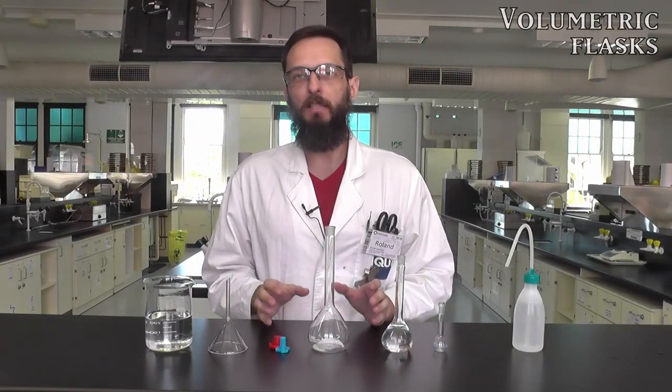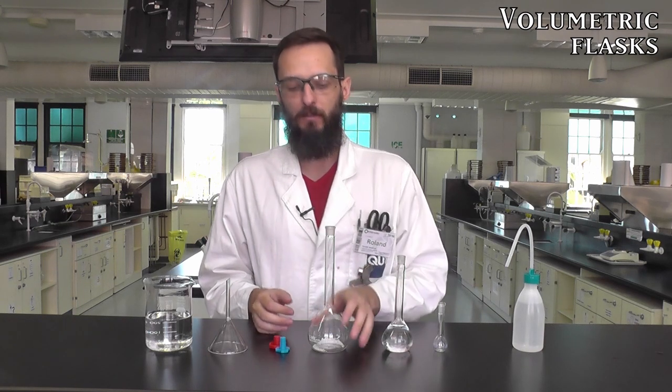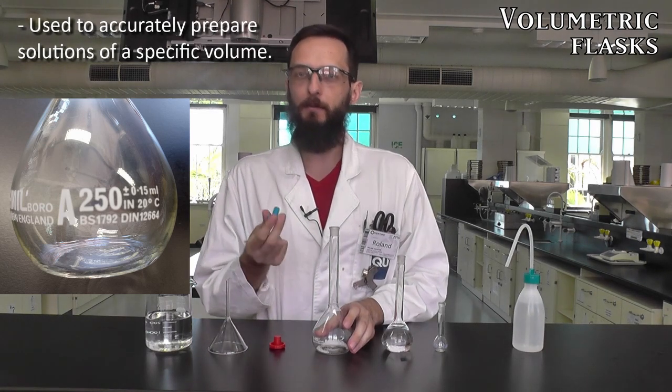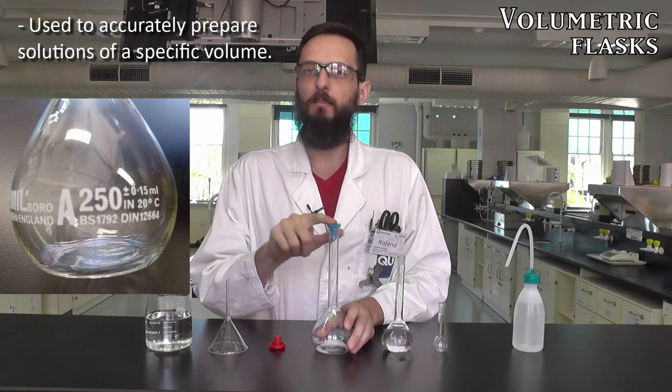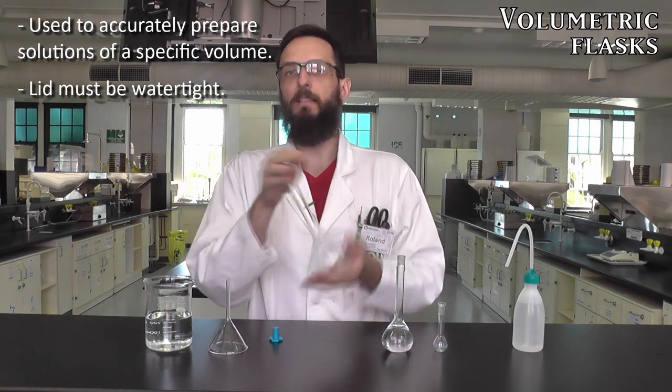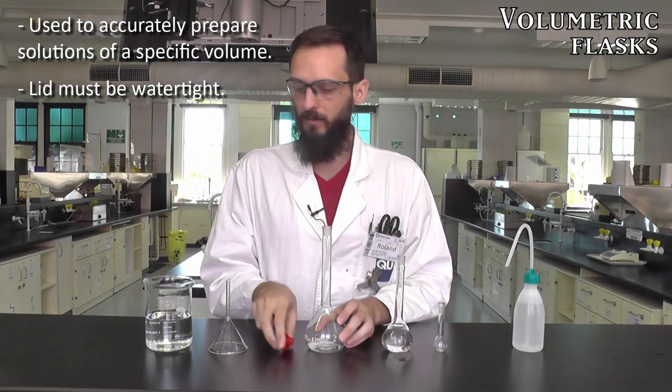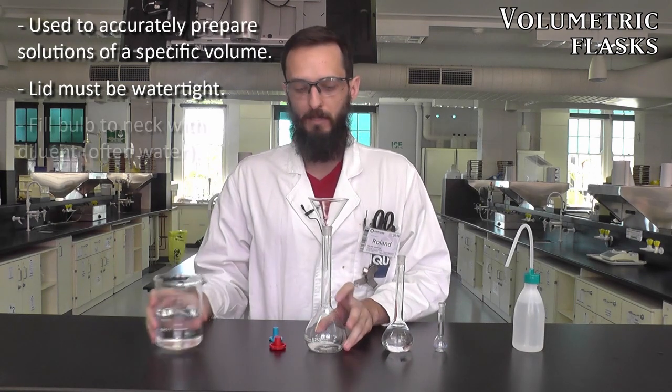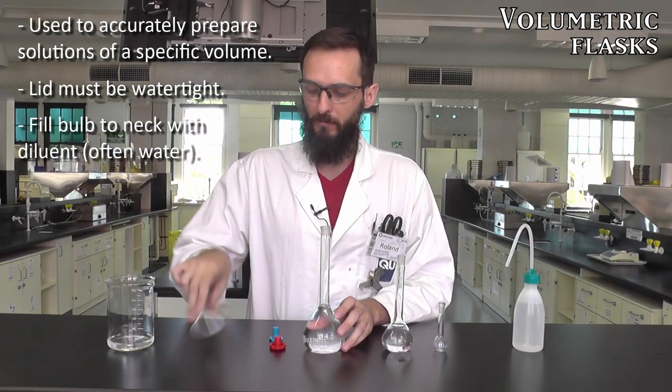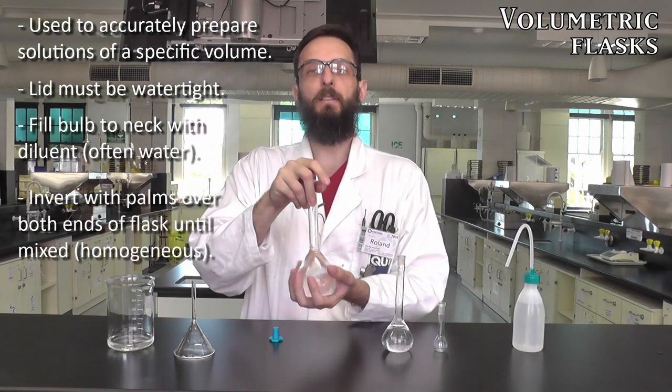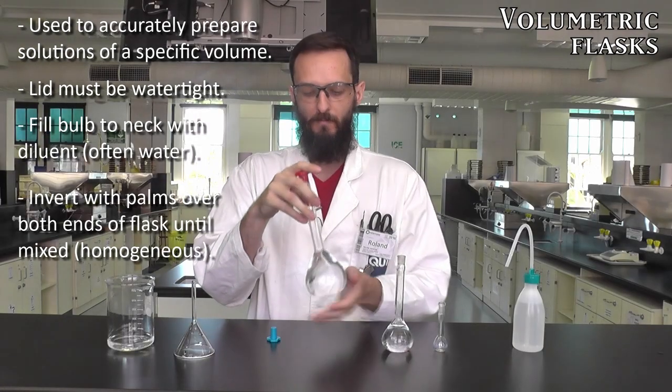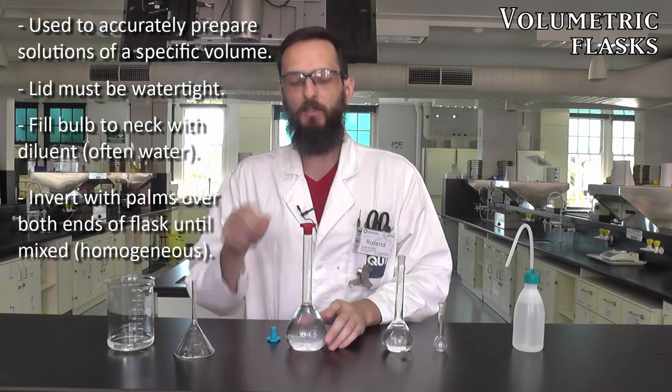Next up we have volumetric flasks. These are used to very accurately measure a specific volume of liquid. You can see it's determined by the label on the front. It's very important when you use volumetric flasks that you pick the correct lid. For example this blue lid, if I stick it in the top, it rattles around. It's important that the lid is very snug because as soon as you were to invert this with any liquid inside you would have a spill. So the way we fill these is I'll take my funnel and fill up to the top of the bulbous part of the volumetric flask, and then I'll take out the funnel, stopper it up, and begin inversion. I do that by placing my palm on the top and bottom and just inverting like so.